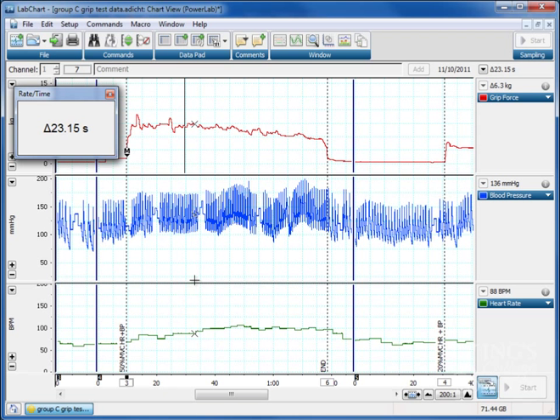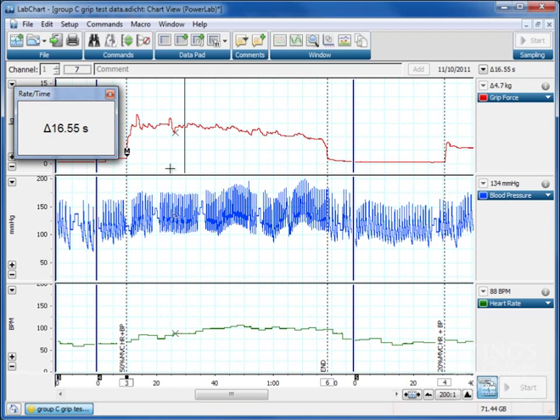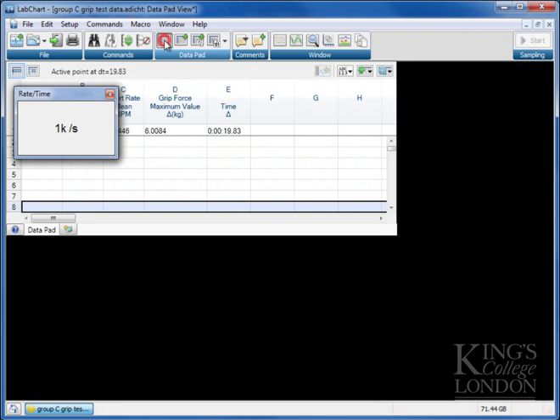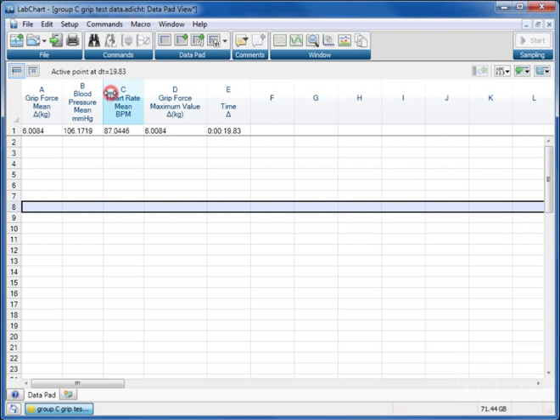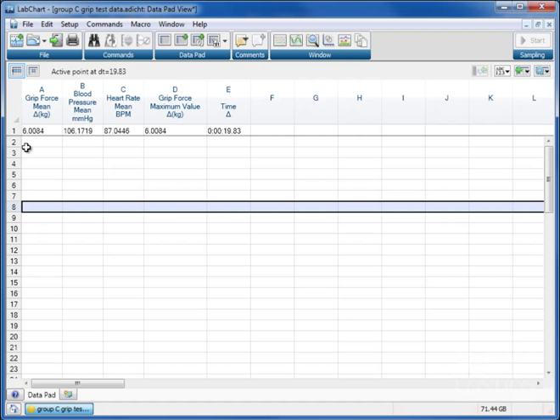The data pad is what's hiding behind the spreadsheet, behind this data sheet, and here it is. So this is our data pad. The data pad is an Excel spreadsheet, essentially, with a series of rows which are our sampling points and a series of columns which are our data that we are sampling.